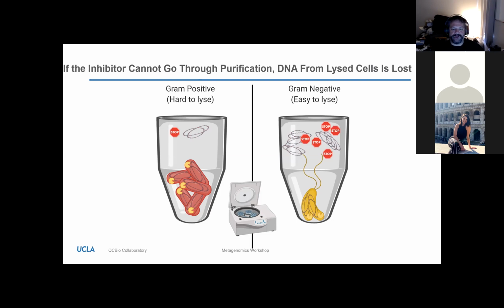It's actually a very good nuclease inhibitor for RNA preservation. I've used it myself before for preserving samples and that kind of thing. However, one thing I learned very early on was you have to make sure you thoroughly wash it off the sample, because even a little bit of RNA-later carryover, because it has some kind of strange salts in it, can really interfere with DNA binding to a column, and it can completely crap up your extraction process.